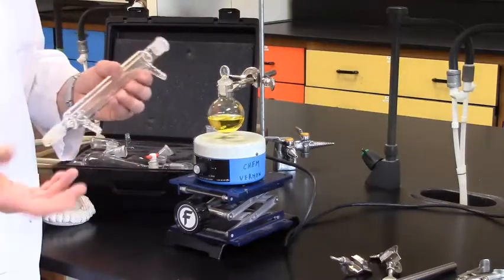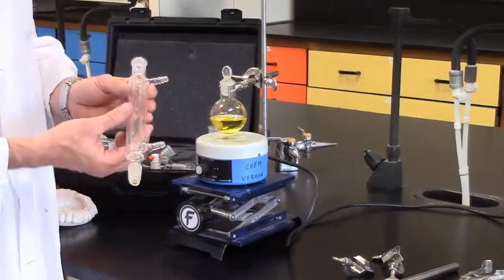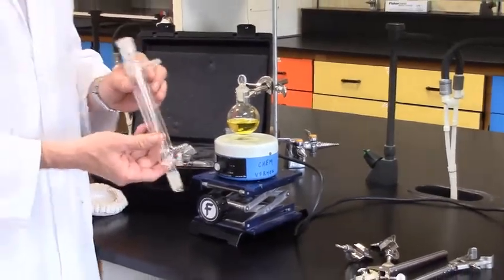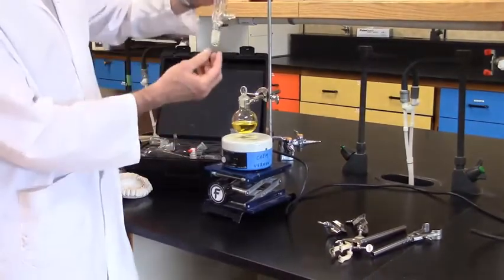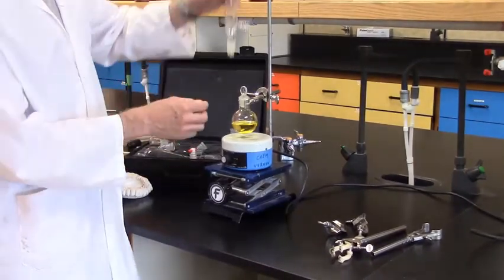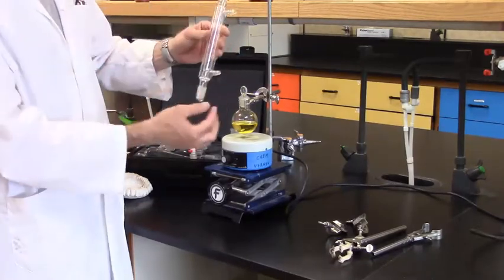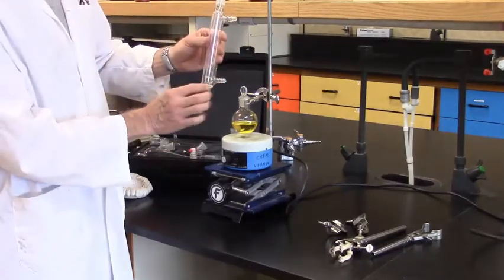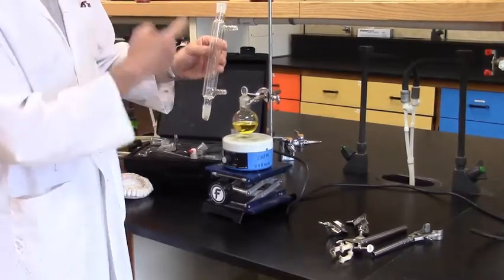We have two types of condensers. They're interchangeable. We have something called a distillation column. It tends to be a little wider. It's got some subtle changes that we need not to go into, but it will work quite nicely. There is a hollow tube. So, when I place it in the flask, it is actually open to the environment. There are two spigots, and a jacket around the inner column, which will pass water through, that allows cooling to occur.